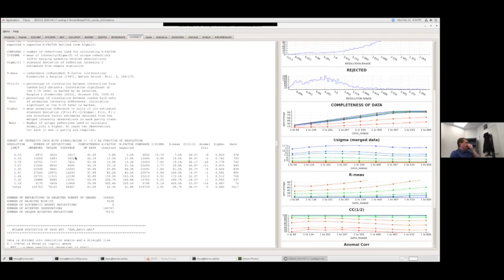Okay. And then the number of possible unique reflections. So here what we want to see is that the number of unique reflections is close to the number of possible unique reflections. We can see that that's pretty consistent throughout. As you get to the higher resolution, that's going to start dropping off, right? So our high resolution shell, 2.32 to 2.18, we observe 5,400 unique, but there was a possible of 13,900. And so we're not really seeing all of the possible reflections that we could have.